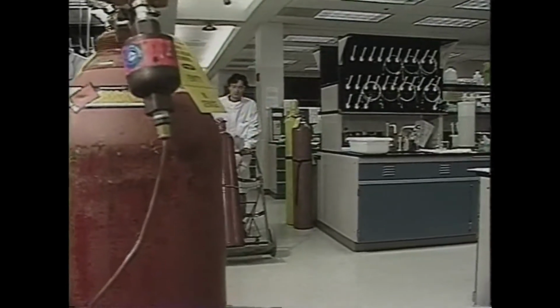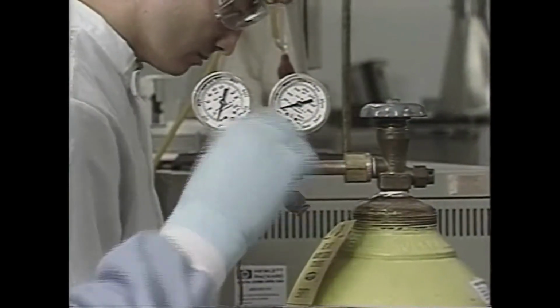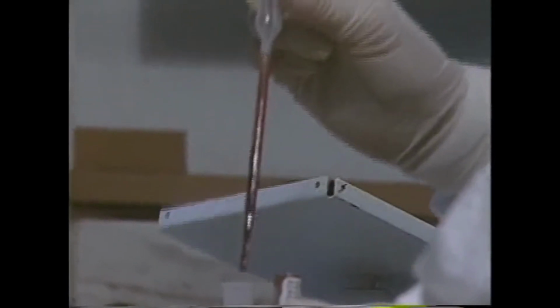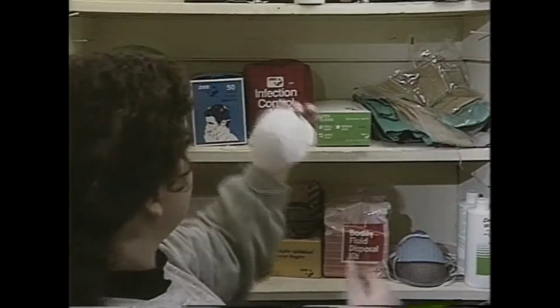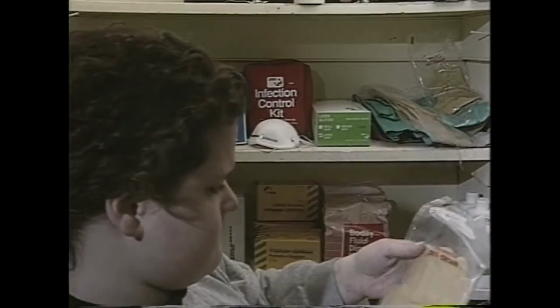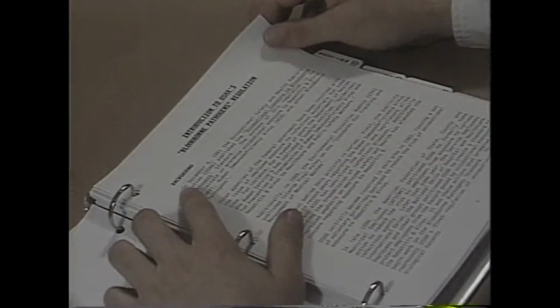The safe handling of compressed gas cylinders is also very important. Chemicals are stored in these containers under great pressure. As a result, the rupture of a valve or cylinder can be extremely dangerous. At times, protecting yourself from biological hazards may be an issue. OSHA's bloodborne pathogen standard focuses on precautions to take around viruses, bacteria, and other bloodborne biohazards. This information can be found in your facility's exposure control plan.